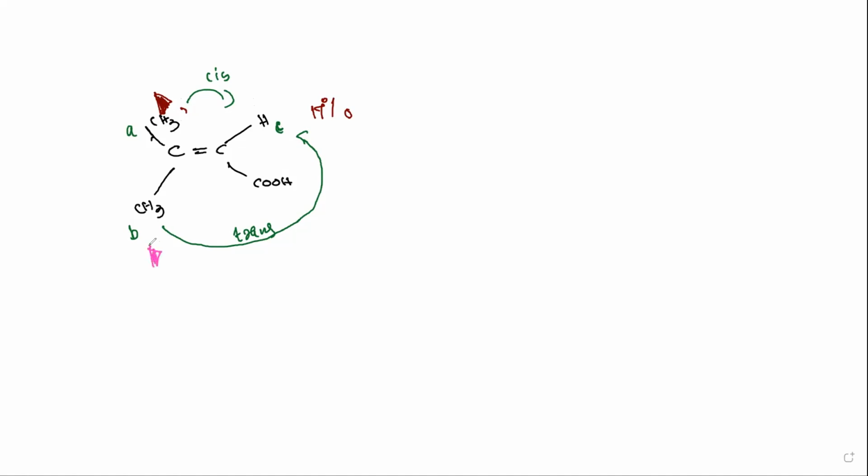Then when we irradiate the trans-methyl group, it does not affect the intensity of the HC proton.